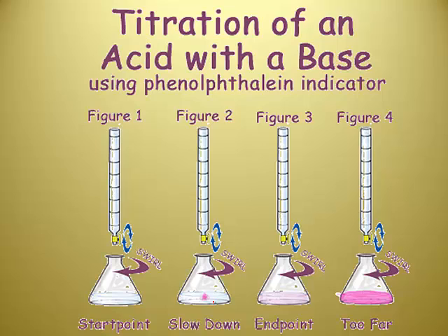So it appears to be darker. Now you want to end when it's light pink and stays light pink. It does not change back for about 10, 15 seconds or so. It's got to stay light pink when you swirl it. If it goes to dark pink and stays dark pink, you've gone too far, you've got excess base. And you've got to start all over.